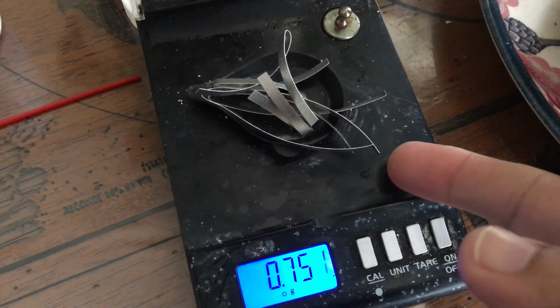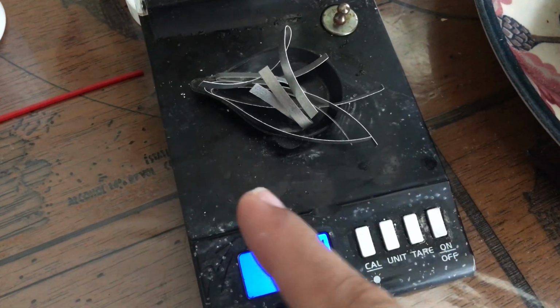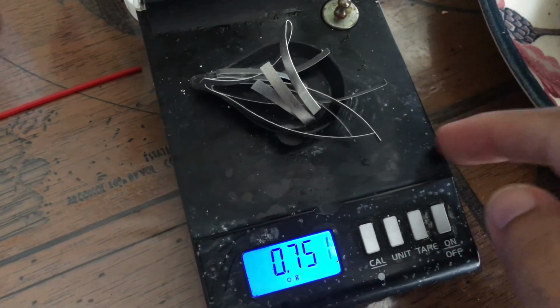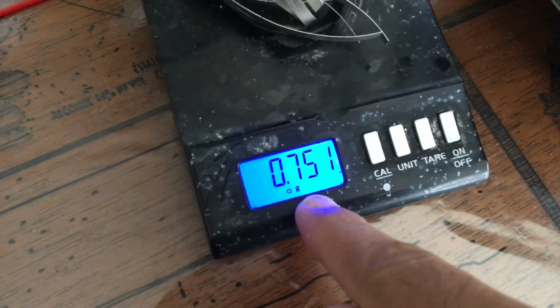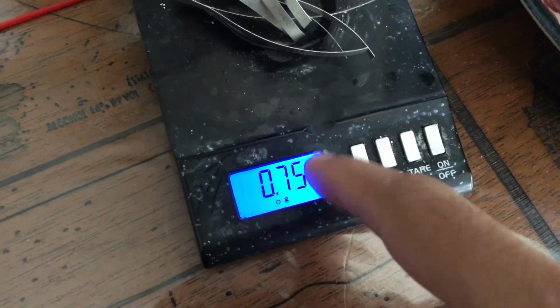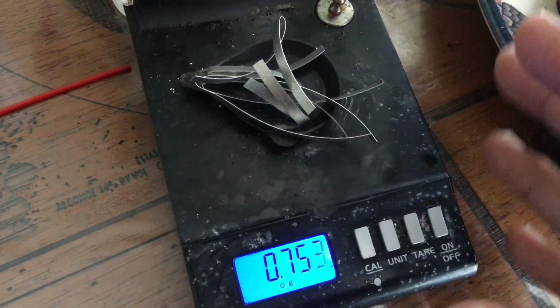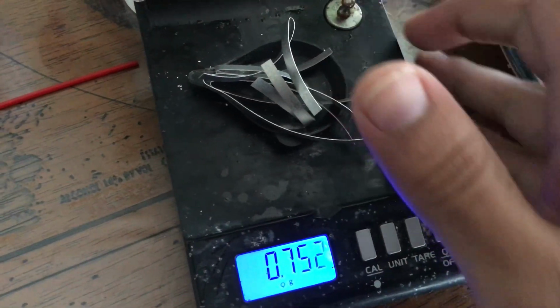So for the original reduction, pure zinc powder or magnesium strips, pure as possible, is used in an acidic aqueous solution with the alkaloid you're trying to reduce. I'll be using a far excess of magnesium. This could easily be used for maybe 2 or 3 times the amount I'm using. So this will guarantee that the reaction is complete and there's no unreacted harmaline.